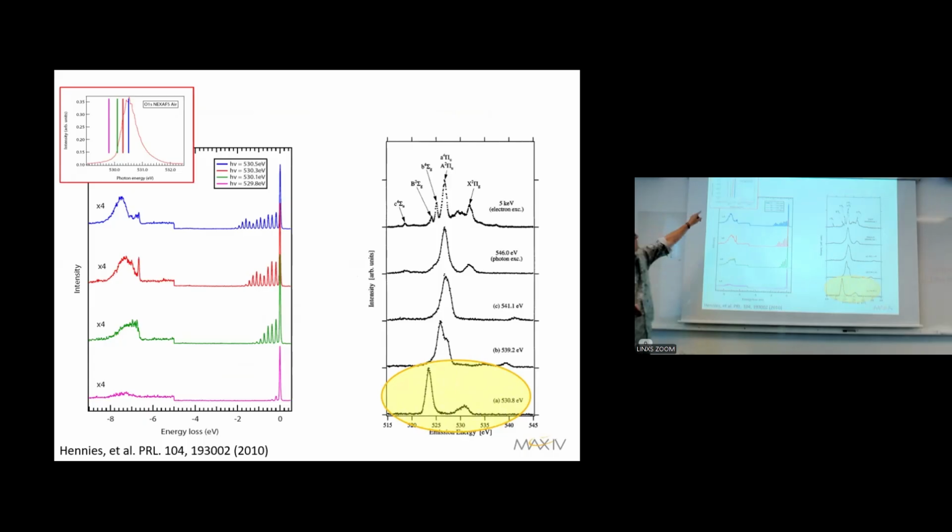What you do then is you don't just, because with the first one, the resolution is only enough to whack the whole excitation with a hammer, essentially. So it's a very broad excitation. Here we can really narrow the excitation, just excite on different parts of the vibrational progression, which you also see is present in the absorption. The top one is the absorption. And then we do those excitations over the first one only, and you see that this holds. You get more and more of these excitations.